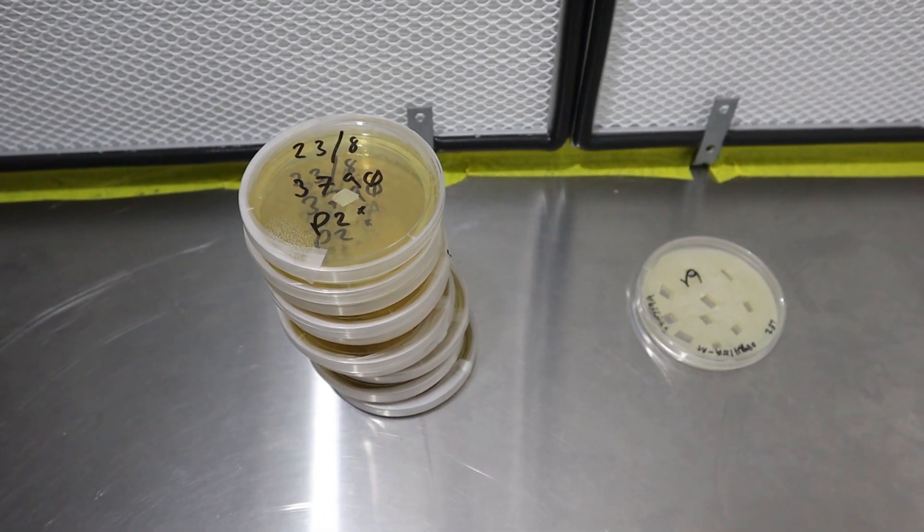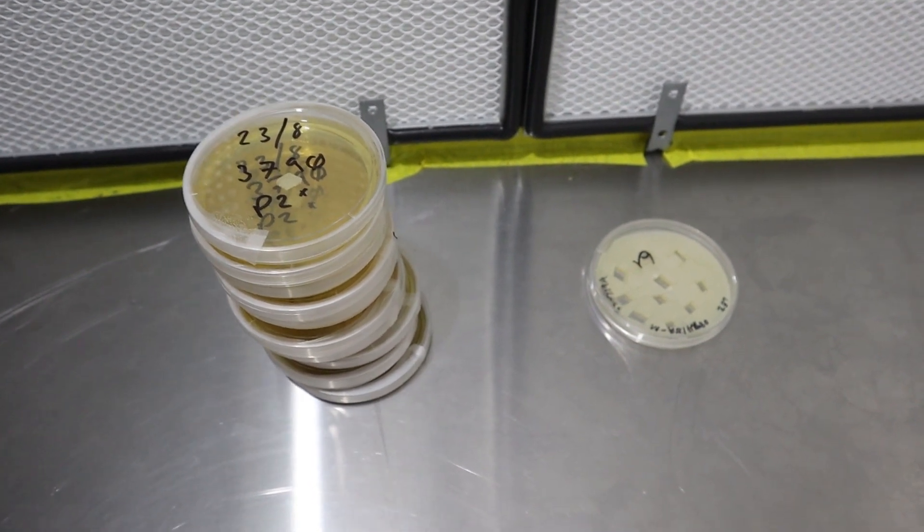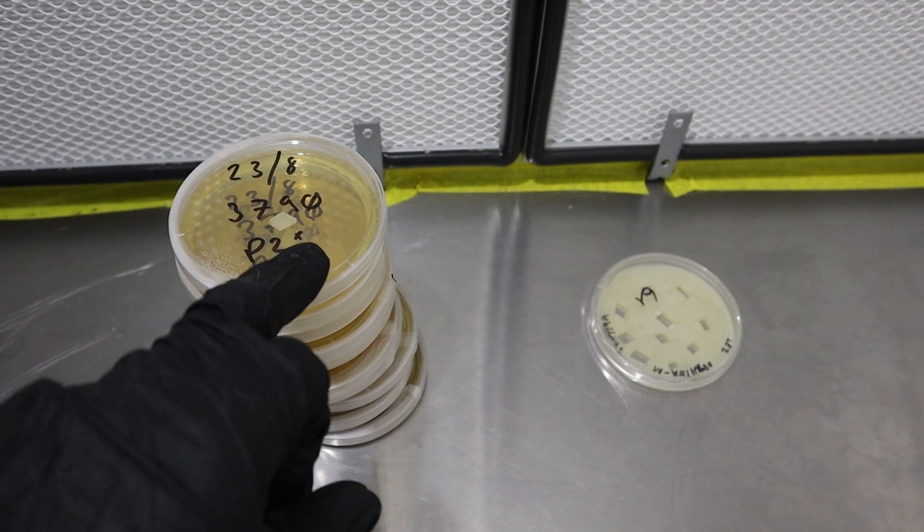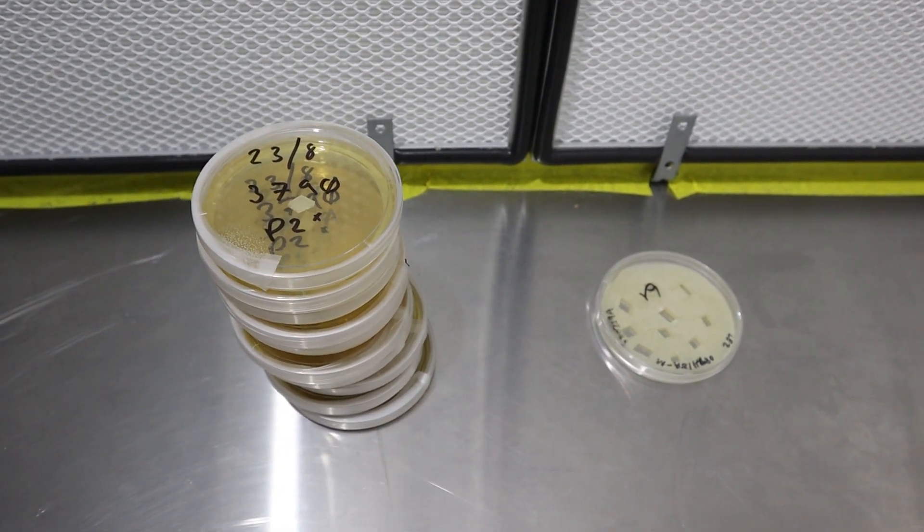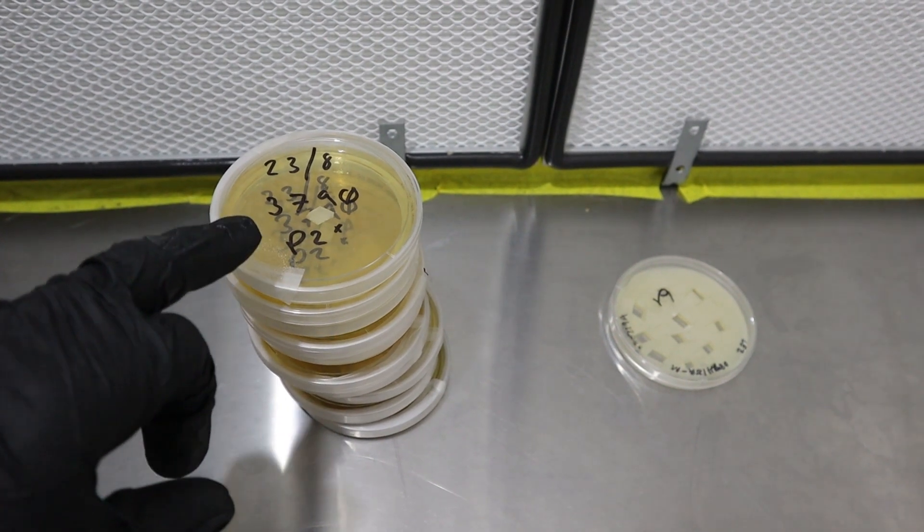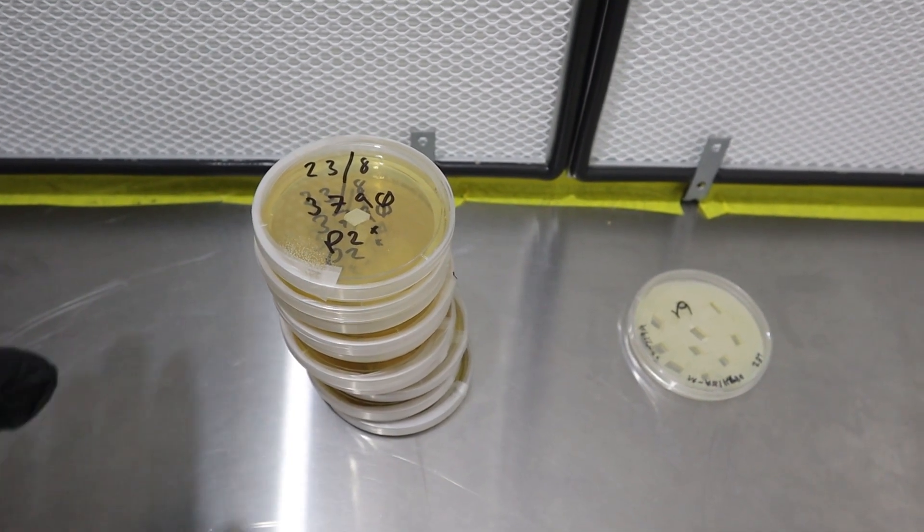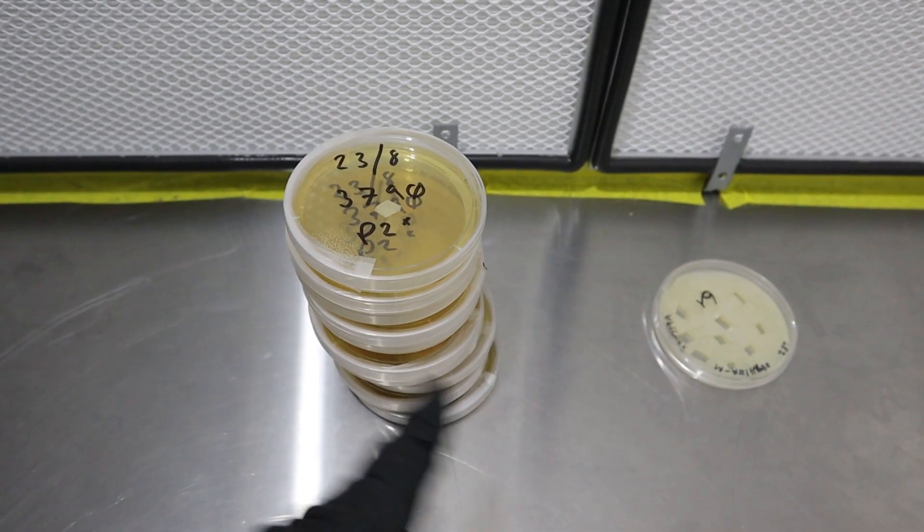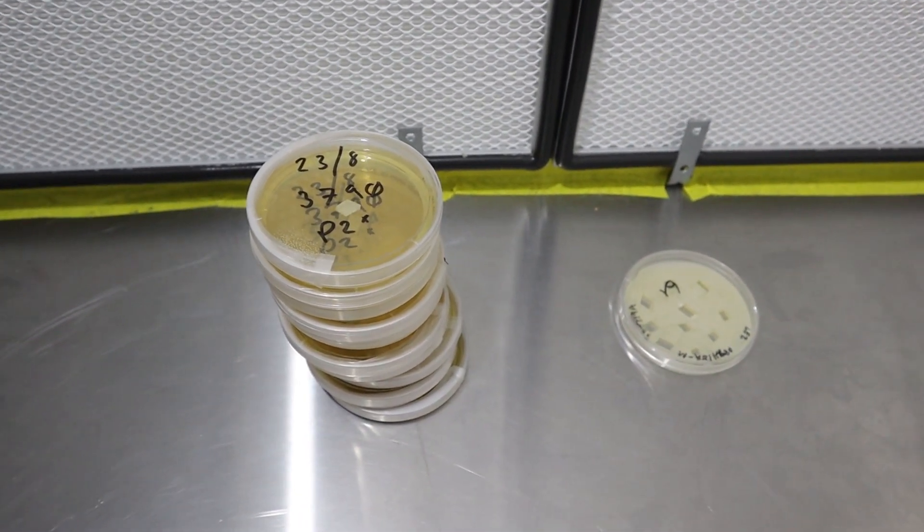The star behind the P2 just annotates that it's incorrect. But for my own keeping, if I was to turn that plate into eight more plates, that would become P3 star to tell me that it's not actually P3, but it's the third down from this being the first, of course.